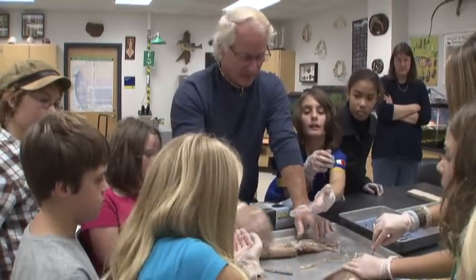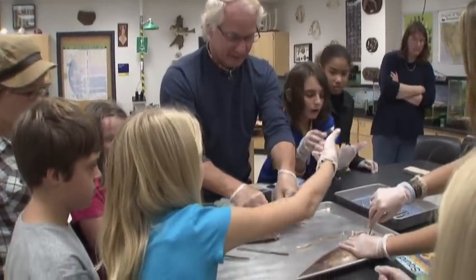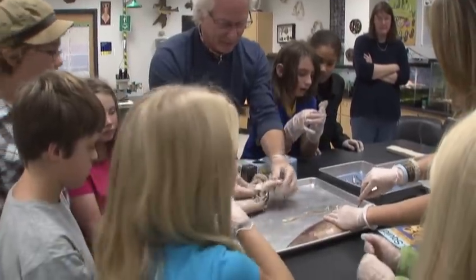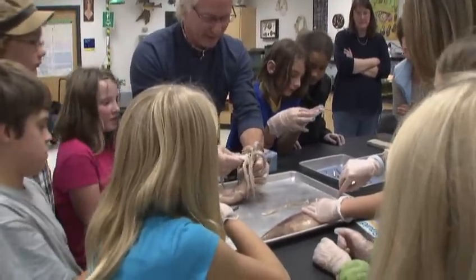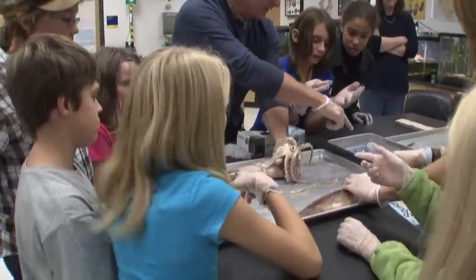Yeah. I'm going to open this up now. Watch, it's really cool. This is kind of slippery, you guys, but I'm going to try to hold it like this. Whoa, okay. Is that the mouth? Yeah, this is the beak. Now, would you pass me a scissors right there?